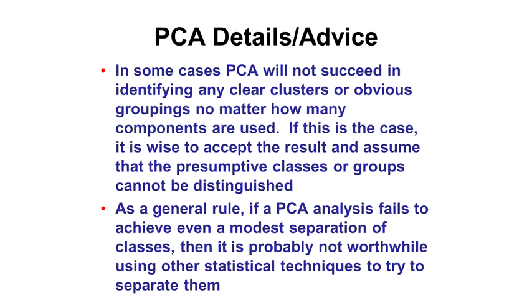Now, when you think you're seeing a separation, and maybe it's not as obvious as you'd like, you can start using a technique called PLSDA, partial least squares discriminant analysis. So this is not a clustering method, it's a classification method, and you need to be aware that they are different. PLSDA is supervised, meaning that you are actually telling it that these are the clusters. Here's the answer to the test. Now do the test. PCA is unsupervised. It says, here's the test. I'll come back in an hour. What's the answer?